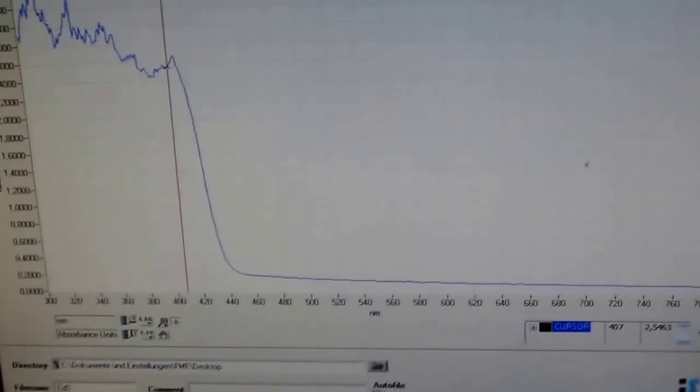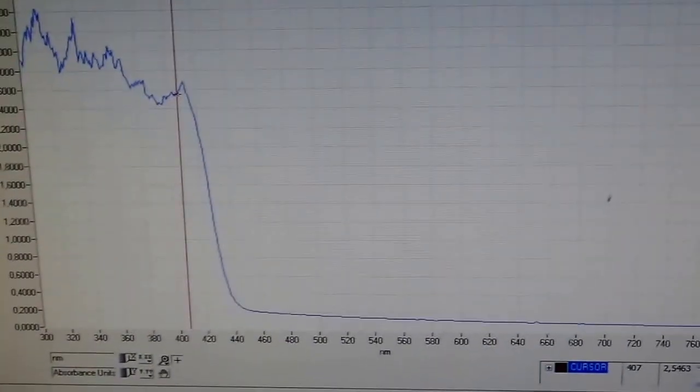Okay, let's go. And here we go. Oh, they're pretty. Wait. They're pretty concentrated. Give me one second.